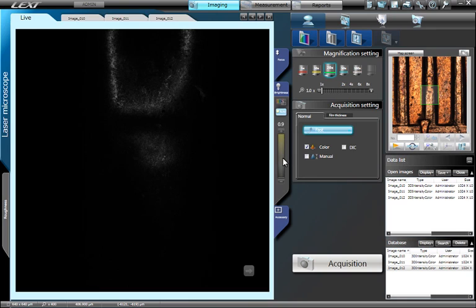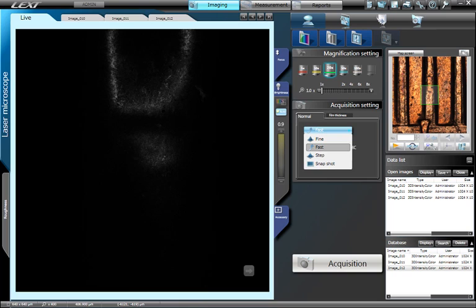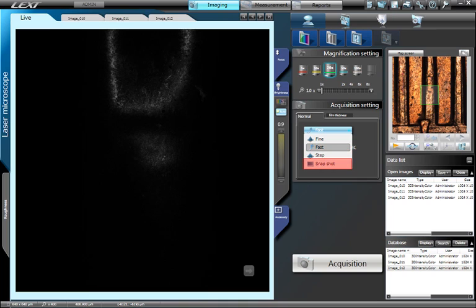Now we will need to define the mode in which the confocal image stack is acquired. There are four modes to choose from. Fast prioritizes the speed of acquisition. Fine prioritizes the quality of the image. Step allows the user to manually define the spacing between images in a confocal stack, while Snapshot simply acquires a 2D single image snapshot.